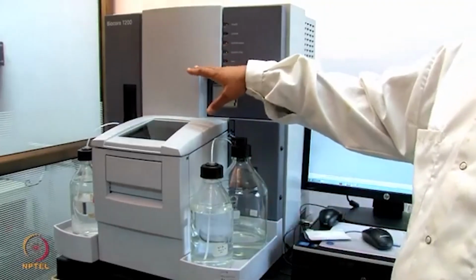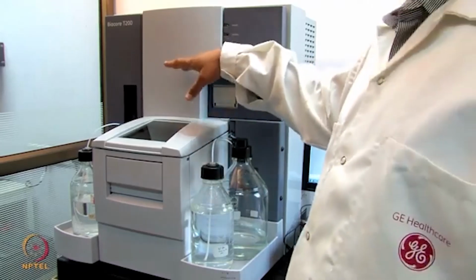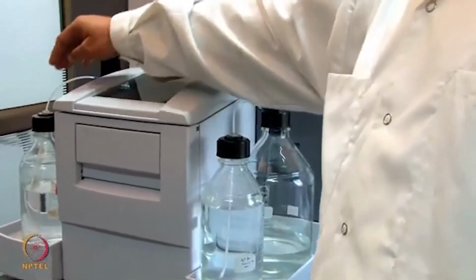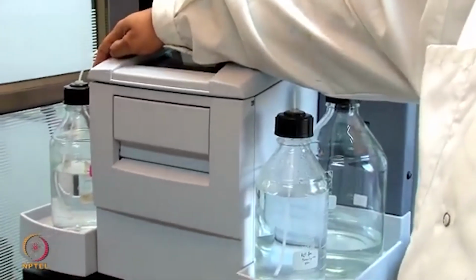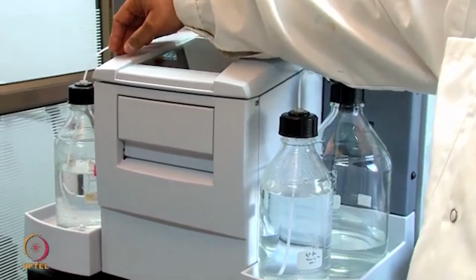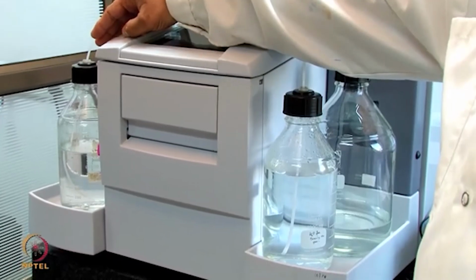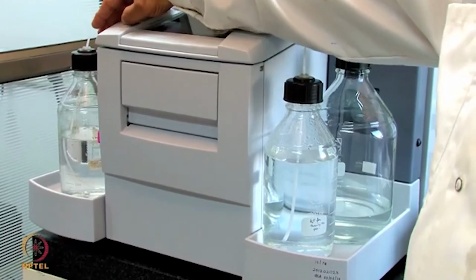So this is a surface plasmon resonance instrument, and it's a Biacore T200. This machine has various parts, like the running buffer is connected here, and any of the biological buffers can be connected as a running buffer. They could have any pH from low to high. So the regular buffers used in a Biacore experiment are HBS-EP, HBS-N, and PBS for small molecule experiments.